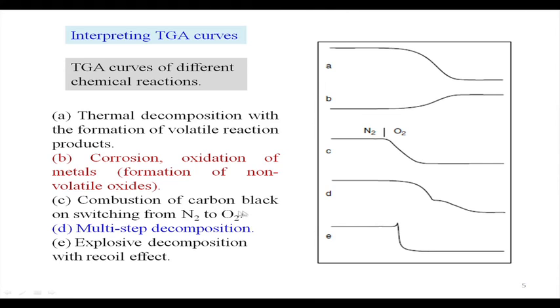It is a very active ingredient and mostly we use it for making different types of tires, the automobile tires, to increase their thermal conductivity. Until and unless you have the O2 environment, in the nitrogen environment there is no such weight loss. When we move to oxygen environment in place of nitrogen, immediately we have the corresponding weight loss due to the degradation of all these carbon particles to CO2 formation. So, this is a very useful technique for that.